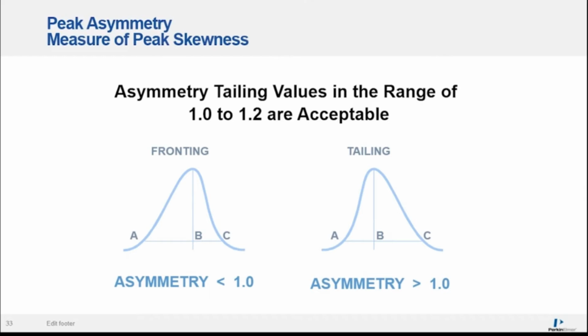But we will almost always see some peak tailing, and that's due to the interaction of your samples, the competition between the mobile and stationary phase. A certain amount of peak tailing is acceptable, and often values between 1 to say 1.2 or 1.3 will be defined as acceptable.